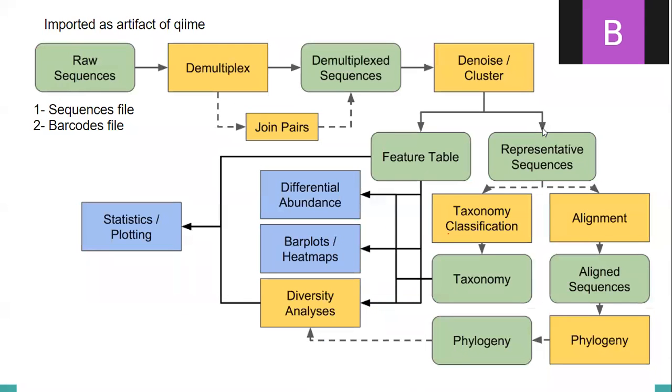Okay. At this step, we imported our sequences as an artifact into QIIME 2, merging barcodes by using the EMP protocol. They have been formed together as an artifact in the QIIME 2 program. Right now, we are going to demultiplex them.